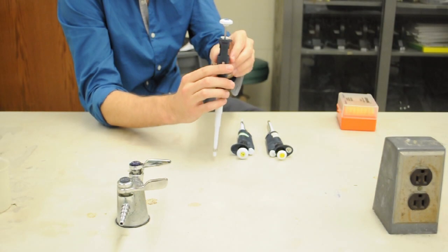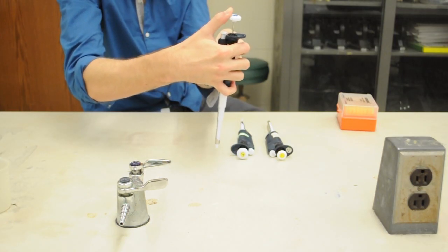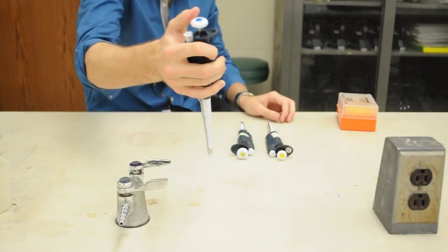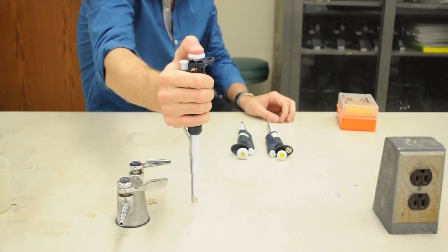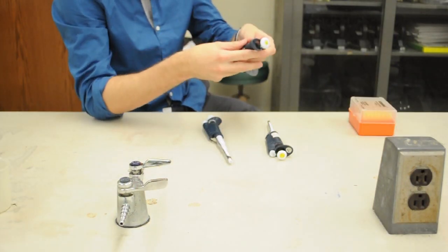Each micropipet has a plunger at the top that has two stops on it. The first stop is used to prime the micropipet to draw liquid. And the second stop is used to expel everything in the micropipet tip.